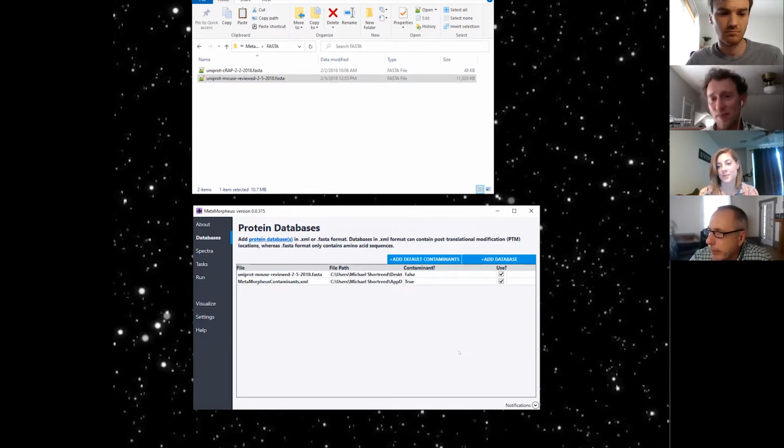What's in your contaminants file? Is this like about 100 things? Exactly, a whole variety of things. Originally, we started with the CRAP database. That was the beginning, and we've adjusted it a little bit since then. Dr. Brian Fry in our lab poured over it quite a bit, and we've added PTMs to those things.